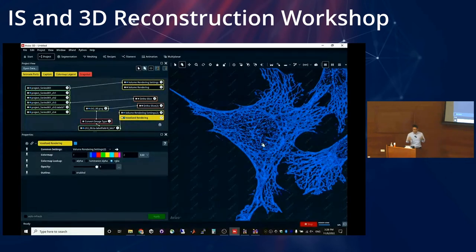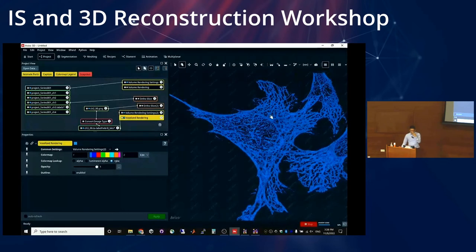So again, you have these tools. You can experiment and try to figure out a nice workflow for your data set. And the good news is, for example for Julia, we figured out a nice workflow for one data set, but she has, I don't know, hundreds of other scans. We were able to automate the step of the segmentation and analysis so that she can apply the process to all the other scans really quickly, okay?